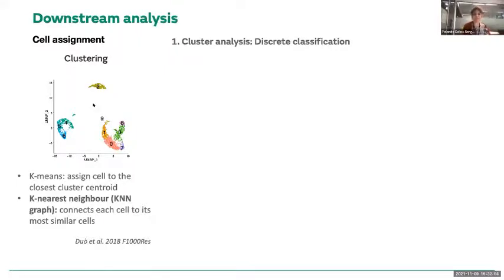So you might sometimes have one cell type that is two clusters together, or sometimes if your resolution is too low, you might have one cluster that actually, if you increase the resolution, will be divided in three, and when you look at the identity of those three, they are actually different cell types. So this is something that you have to play around with and look at.